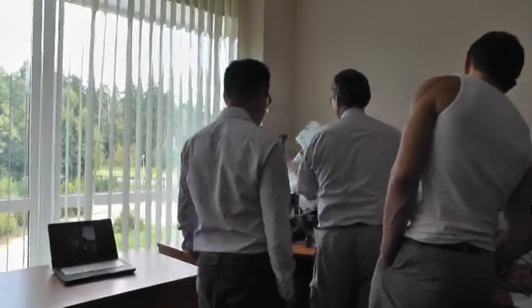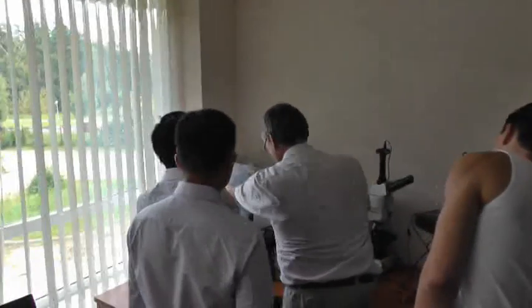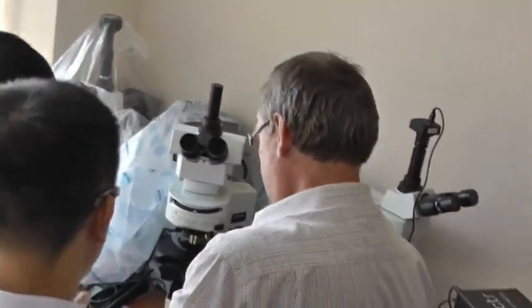This is also Olympus, but this is the Olympus BX51. Here you have a reflected light illuminator, but this can be empty, I think.